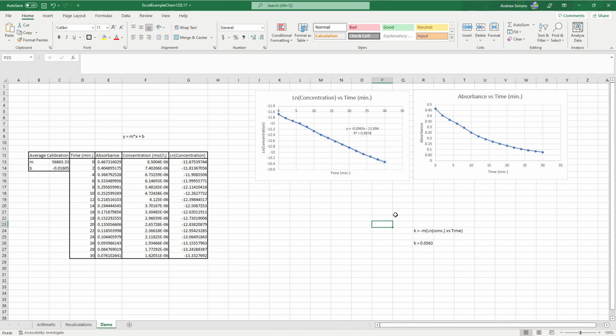That's kind of a crash course in Excel. Hopefully this video is at least a little helpful. You can back it up, watch it again. You can literally follow exactly what I did step by step with your data. You can set up these exact same tables the way I did, because this is the starting information you'll get. Your absorbance values will be different, but they'll be pretty close. And from there, you can just set up all this stuff exactly the same way I did.